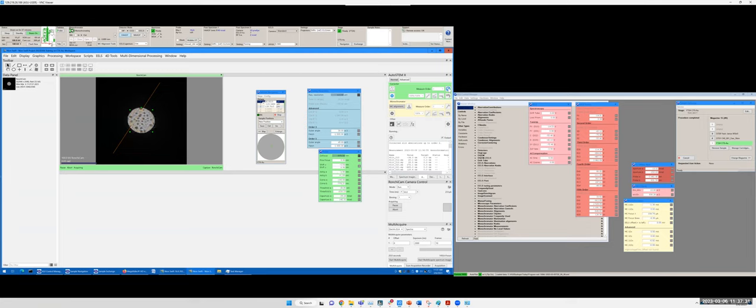So we normally want to measure the probe, fix the probe, and then measure the monochromator. So we measured the probe aberration, we fixed the probe aberration, then we measured the monochromator aberration. Now I want to fix the monochromator aberration. And then we can look at those values. You can see that these are okay, not very big. So that's good. So we'll do a final cycle and finish this part.